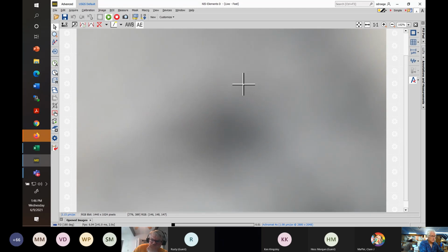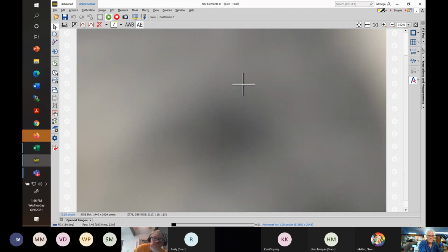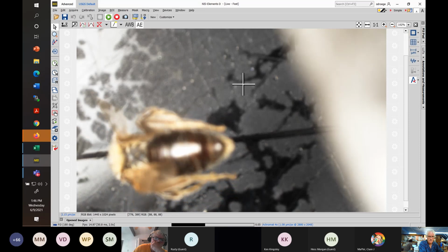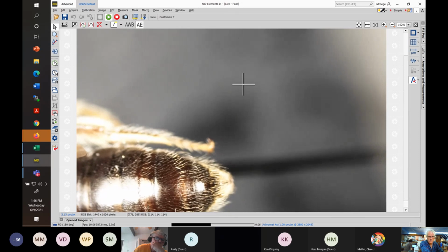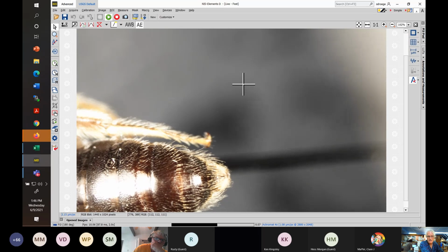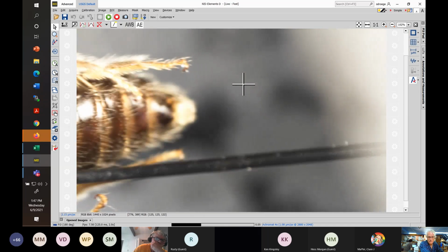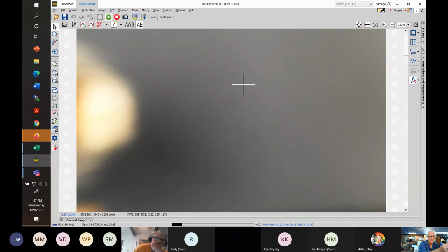Let's look at S8 in this Perplexa and see what's going on there. I did not preview these specimens, which is good, right? It's reality. So there's the tergites view on top, and normally you don't see much of S8; you're lucky if you can see it projecting out, and I don't see it at all right now. So let's turn it over, and there's no genitalia projecting out either. And zoom down, you might have to zoom in here to see something.